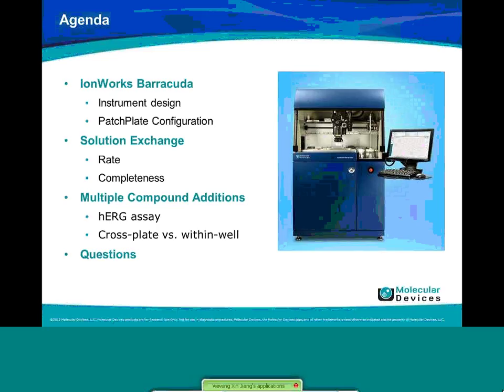The last part of the talk will be focusing on a case study using a real ion channel, the HERG channel in this case, and to study the pharmacology of the HERG channels using both a cross-plate type of design, which is similar to a flipper type of experimentation, and also a within-well type of design to look at the pharmacology in a cumulative fashion. So I'll show you the data that compares the two different sets of experiments.